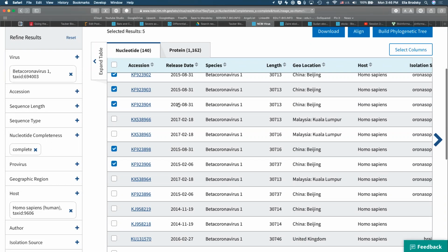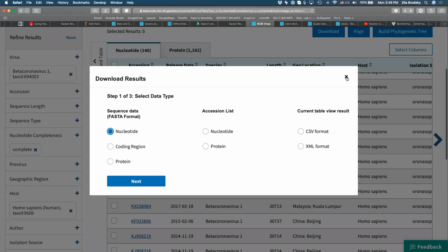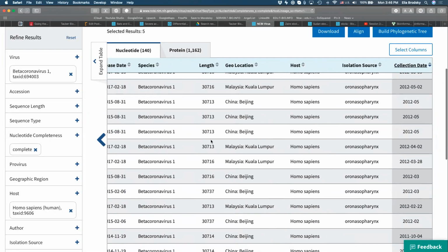So one of the ways that I can generate the selected samples as a single FASTA file is to click on download. Sorry, why did we select those? Well, because we want to minimize variation based on any other phenotype except for the one that we are trying to measure the difference in. So the differences that we want to measure right now is difference between the different strains. Strains are beta coronavirus 1, SARS-1, MERS, and the novel coronavirus SARS-CoV-2. So if we want to eliminate all of the other variants might be related to the location. So that's why we only chose China.